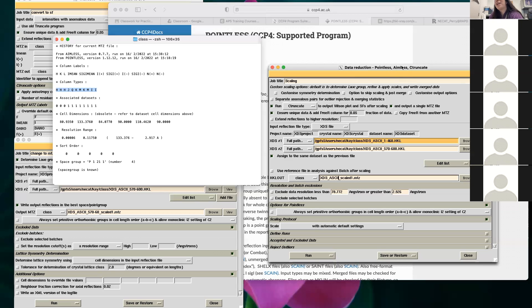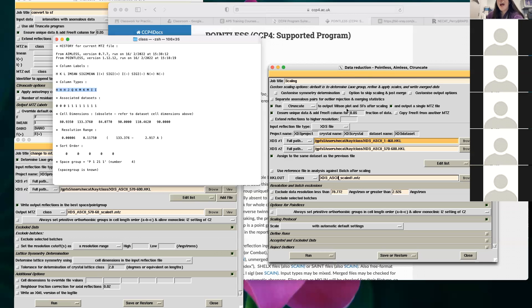If you stay in the CCP4 suite and use Phaser from there, you need to convert using ctruncate to structure factors. They chain it all together. In this step you can also add a free reflection column. Phenix will add it for you — you can say I have no free Rs and then add it in.